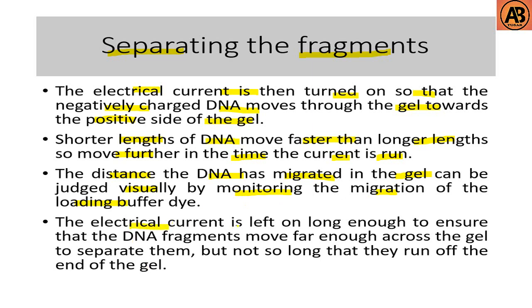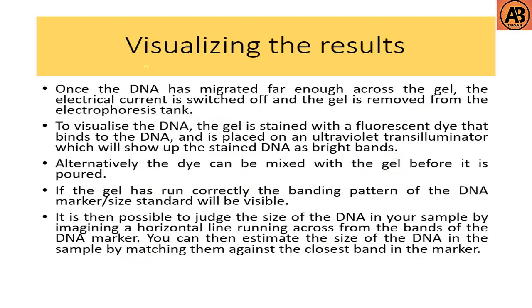The electrical current is left on long enough to ensure that the DNA fragments move far enough across the gel to separate them, but not so long that they run off the end of the gel. So this is separating the fragments. Then the last step is visualizing the results.